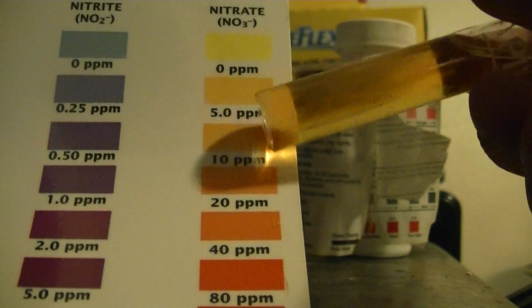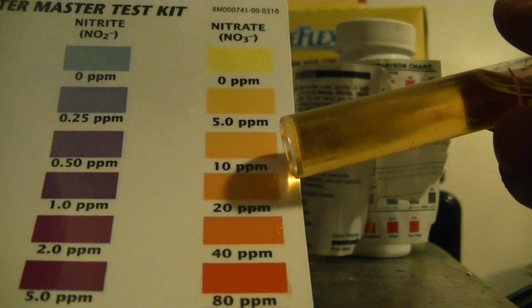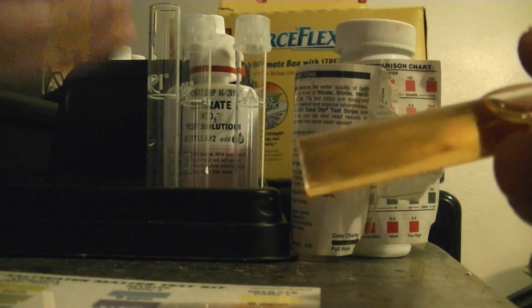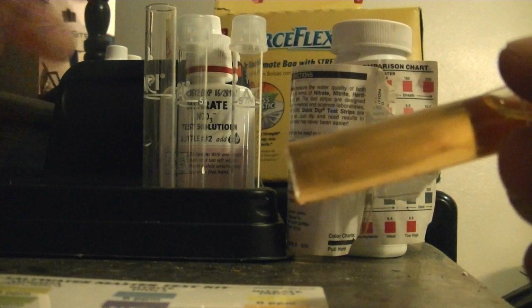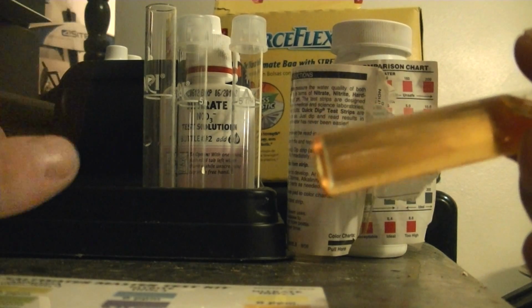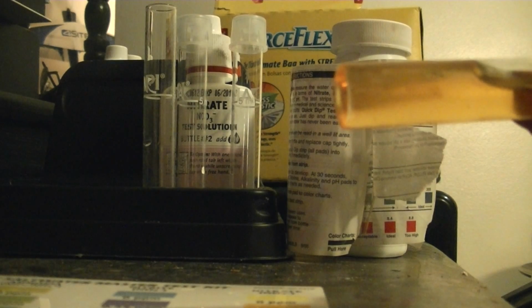So yeah, I would definitely recommend getting a liquid test kit. Don't be scared to use them. The directions are really straightforward. I never really used them in the past that much, but the directions are really straightforward. They're really easy to use. This test was the hardest test because you have to use 2 bottles. Most of the other tests, like I said, you just use 1 bottle, shake it up, and then check the color. But really great, a lot more accurate is what everyone online says.